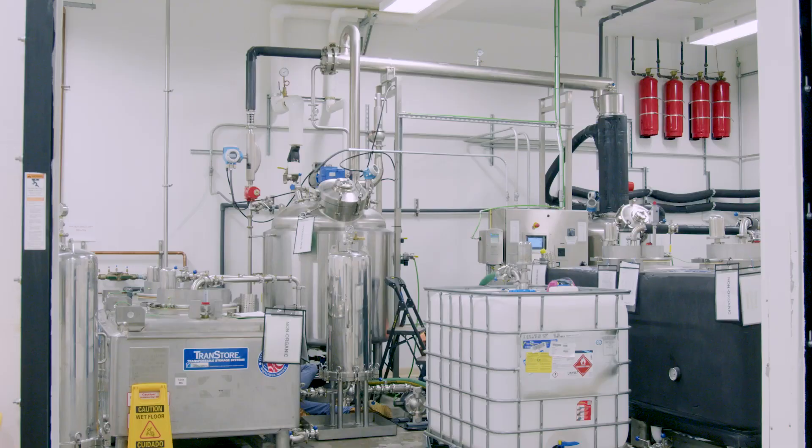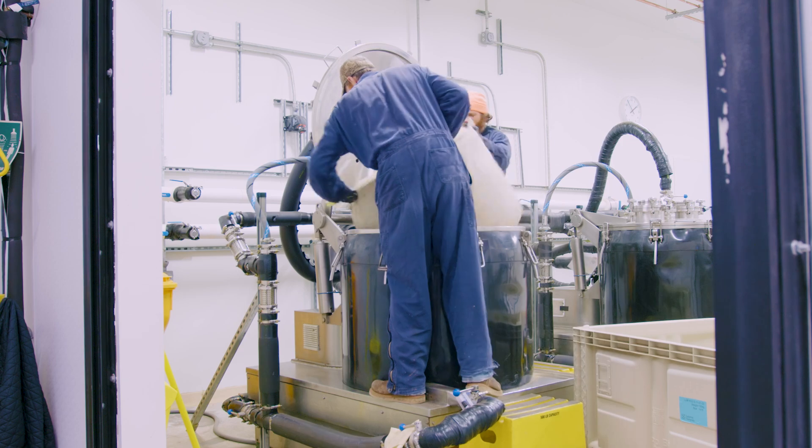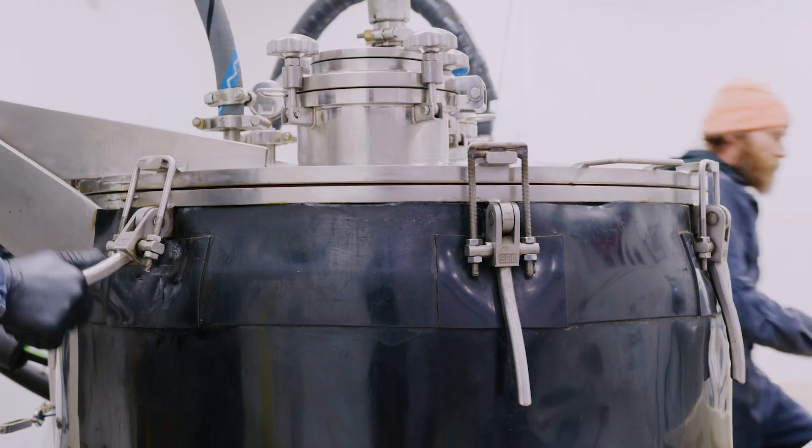Control and visibility on the process — that's really been the key. We use a solvent-based extraction and operate at negative 40 degrees Celsius, so we're chilling the solvent. We use ethanol as our solvent, which is great from a scalability perspective.